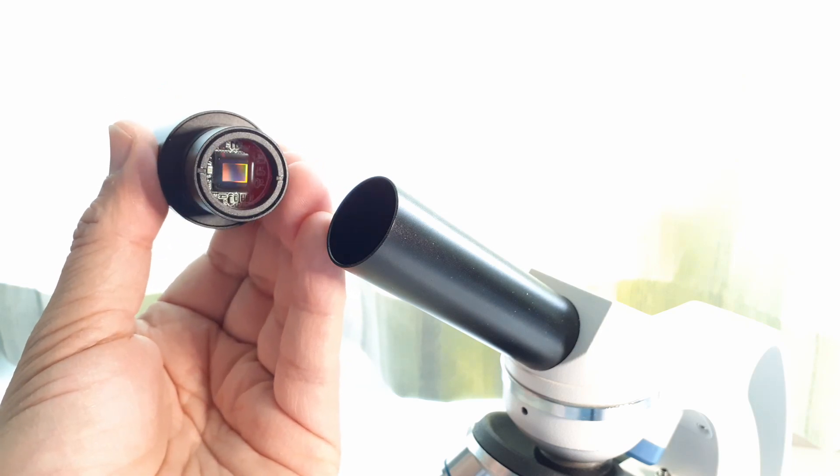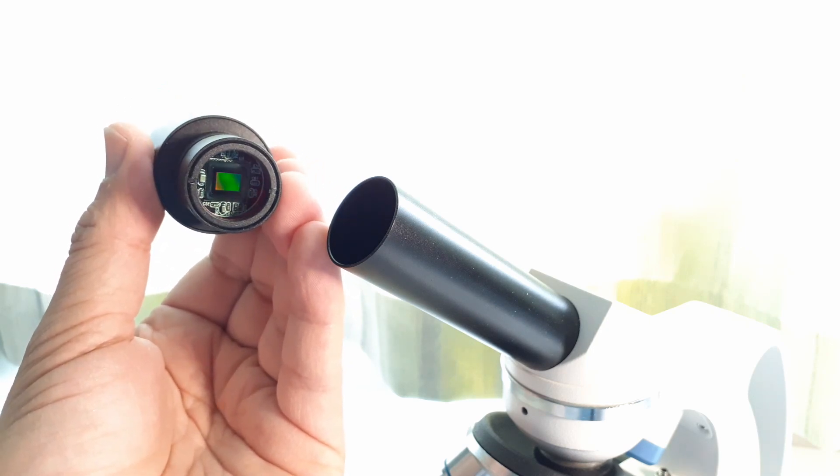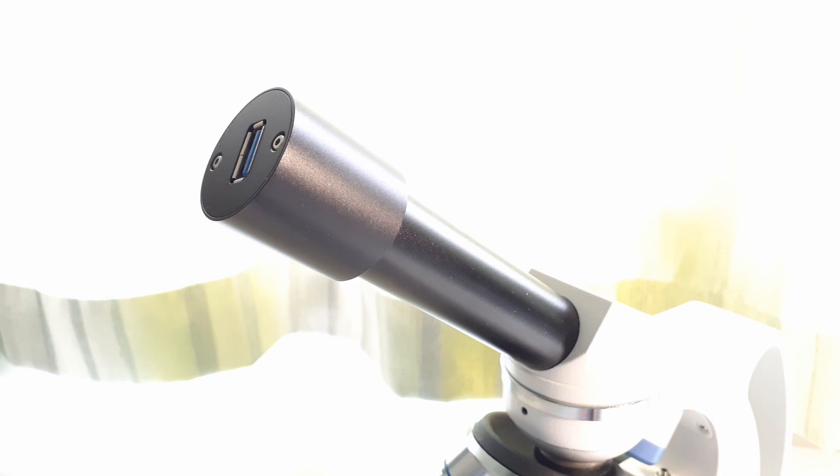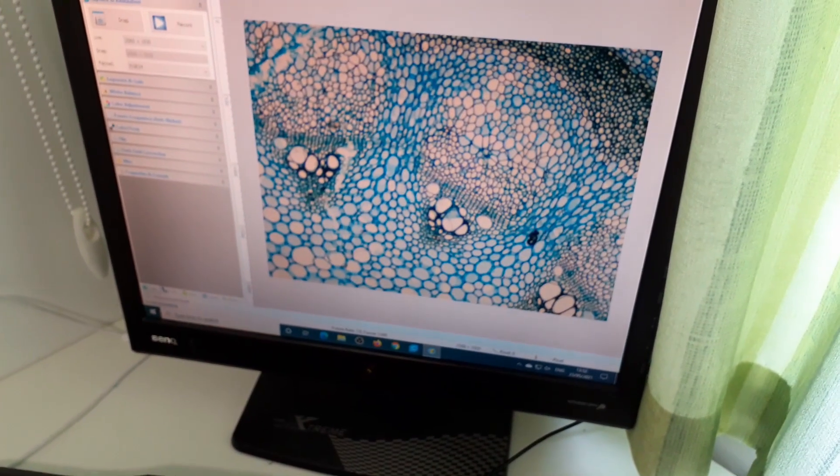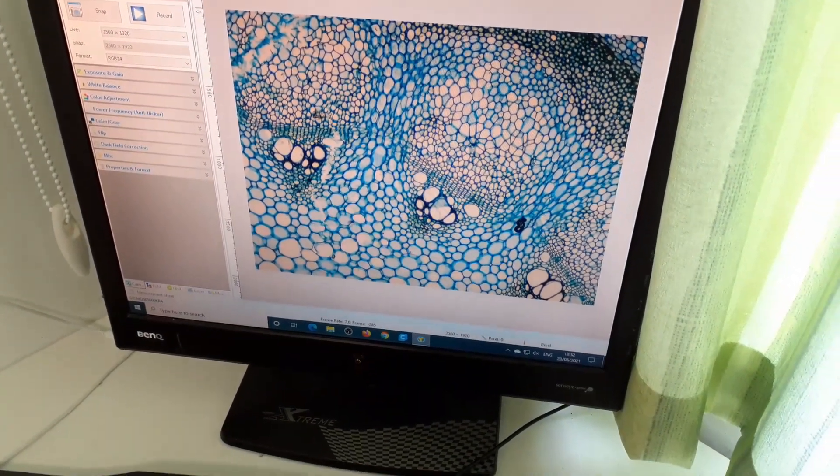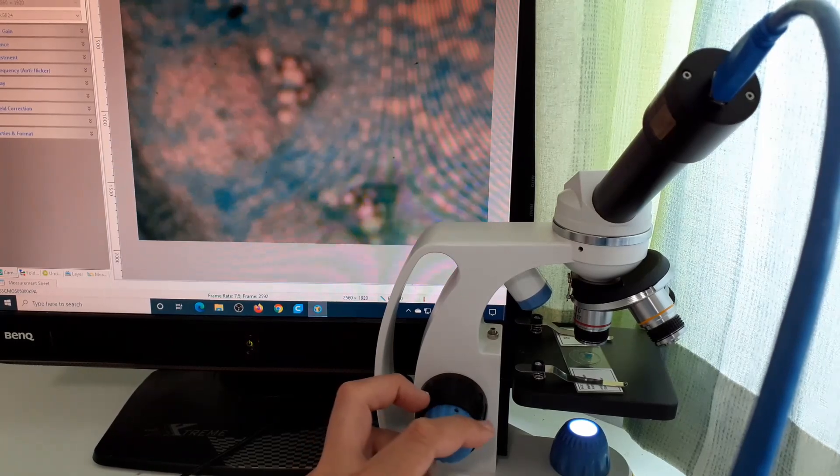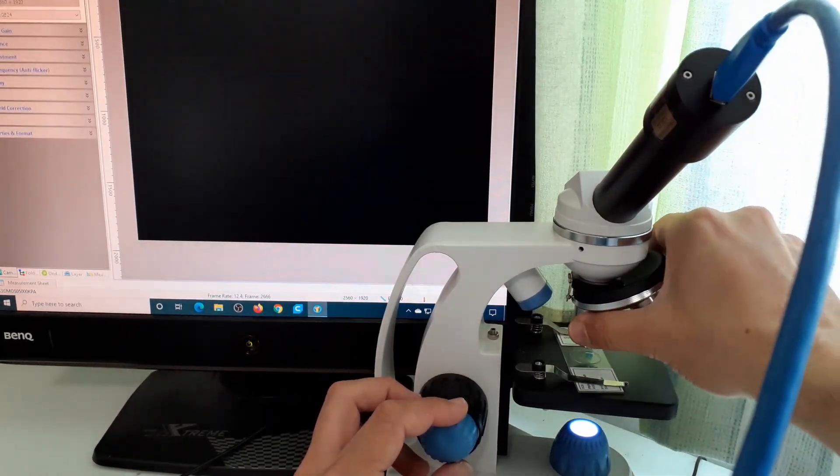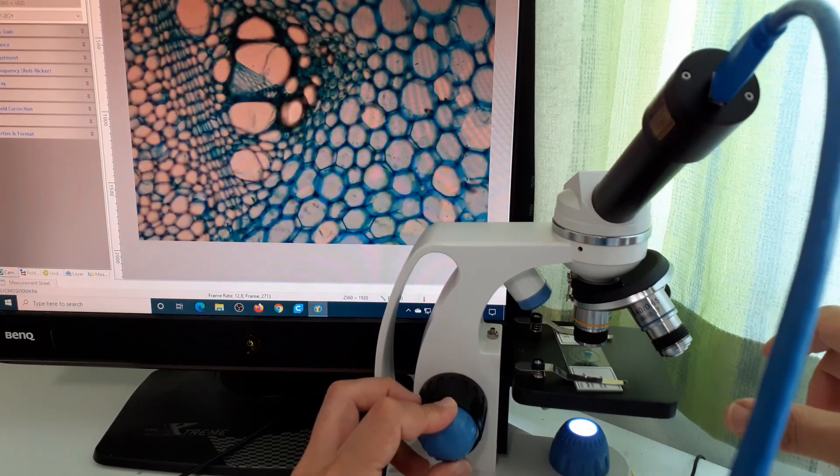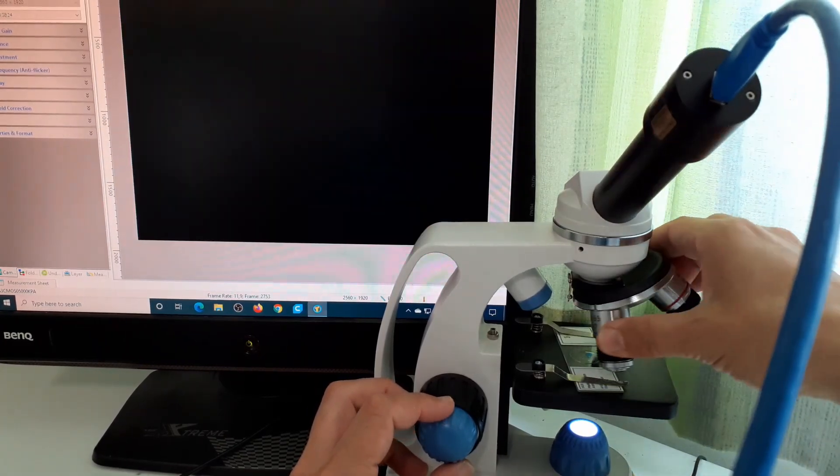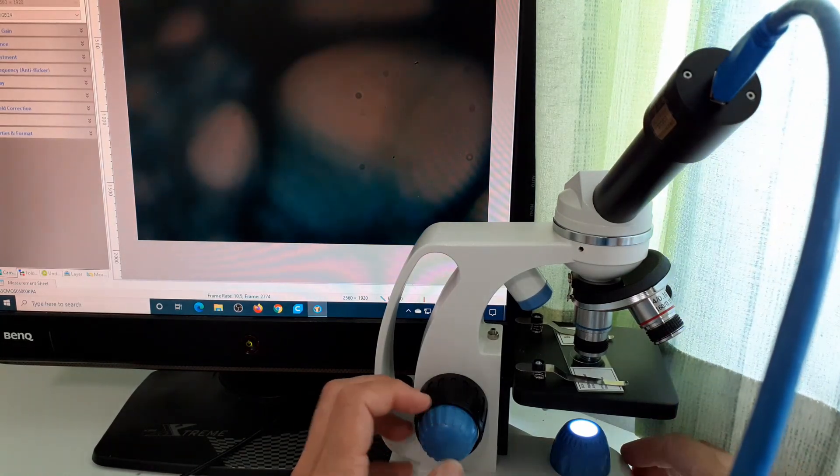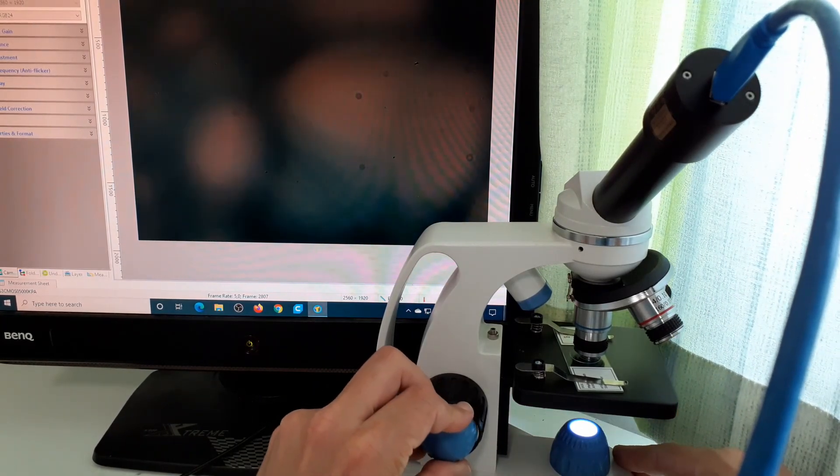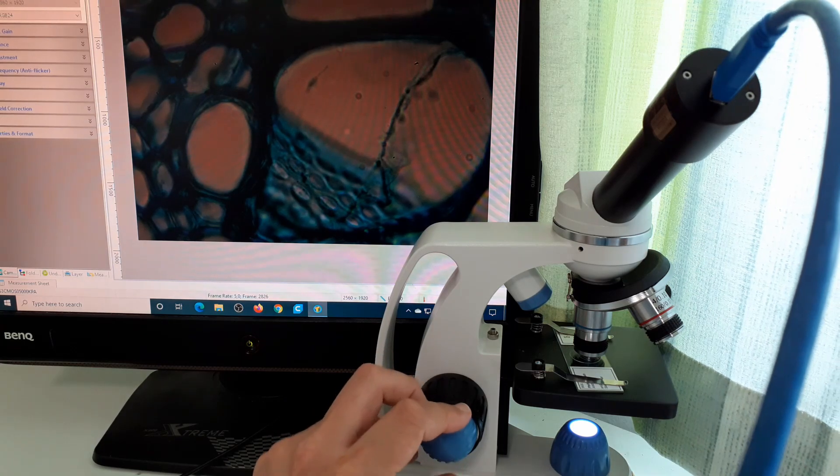I'm now trying a USB microscope camera. That's not included, I have to say that. It simply plugs in there instead of the eyepiece and I'm now going to connect it to my computer over USB. This here is a cross section of a plant stem, it's one of my reference slides that I use. By essentially turning the focusing wheel I can of course also adjust the focus now. This of course allows you to also do microscopy on a computer monitor. I'm changing the magnification but at the higher magnifications it's already getting kind of dark, so what you have to do is adjust the gain or the exposure time of the camera.